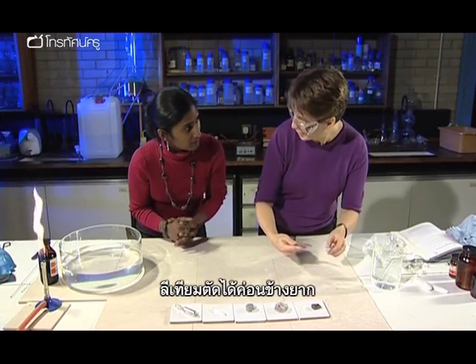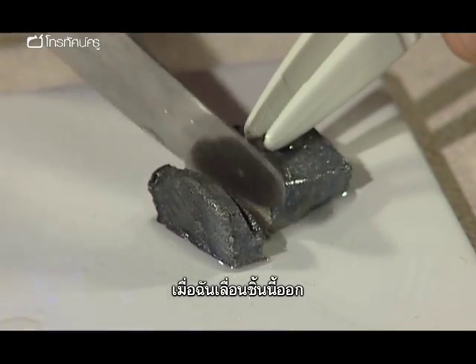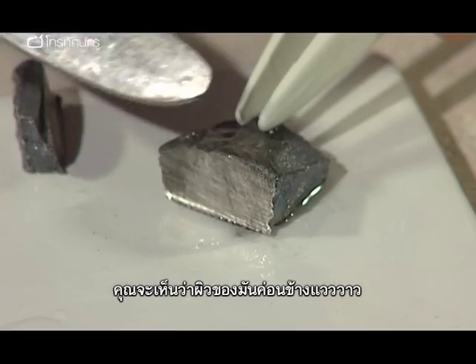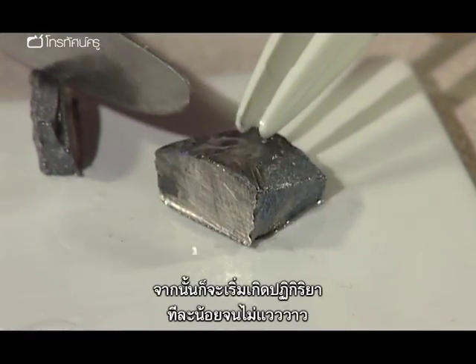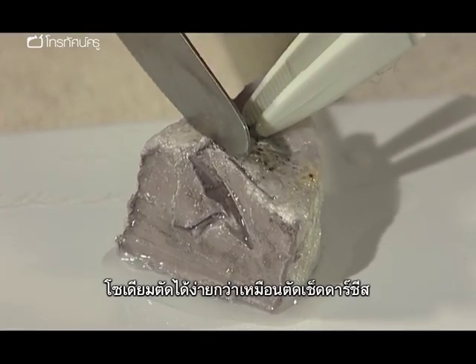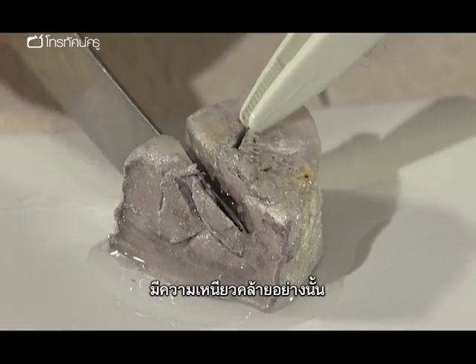Lithium's actually quite hard to cut. And then if I just move that bit away, you can see the surface is quite shiny and it'll just gradually start to react and tarnish. You can see it tarnishing already. Yeah. Sodium's much easier to cut. It's almost like cutting cheddar cheese. It's that sort of consistency.